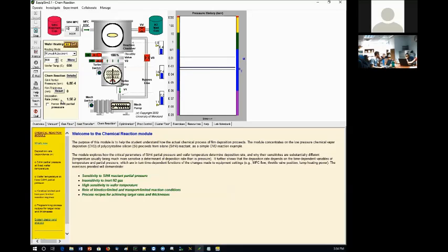And then we can flow in more and more. So 50 would give us 7.3 times 10 to the minus 3. So see what's happening. Film thickness is increasing. So we are growing thin film. 1 nanometer has been grown. So once we enter 100 SCCM, now it's 2 nanometers. We have a growth rate of 1.4 times 10 to the minus 1. It really gradually increased.